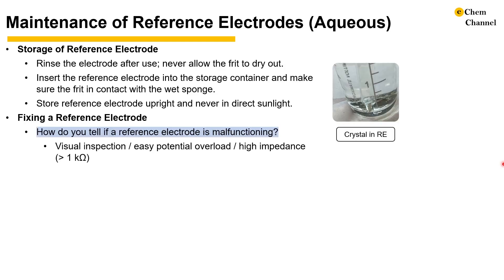The last topic we would like to cover is dealing with malfunctioning reference electrodes. When an electrode malfunctions, it may lead to easy potential overload. You can inspect the reference electrode visually to see whether there is a color change or crystal growth near the frit. In the figure on the right, you can see a large salt crystal grown on top of the frit, blocking it completely.